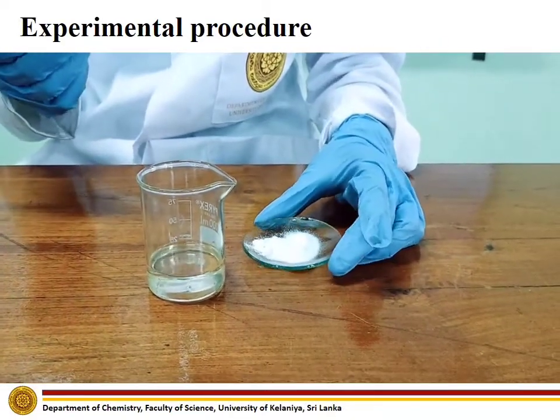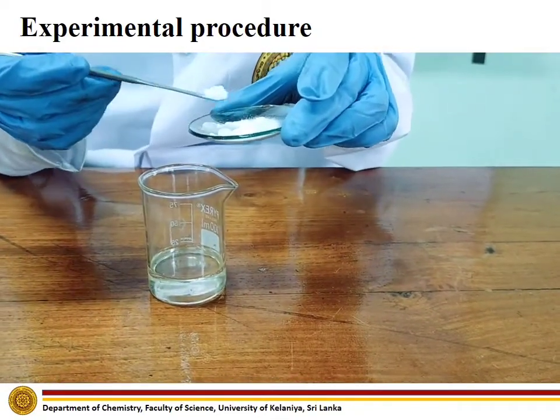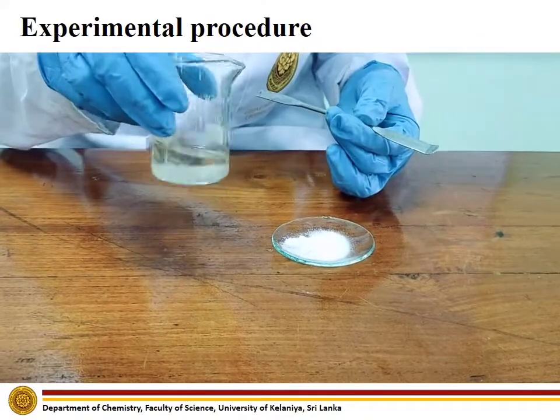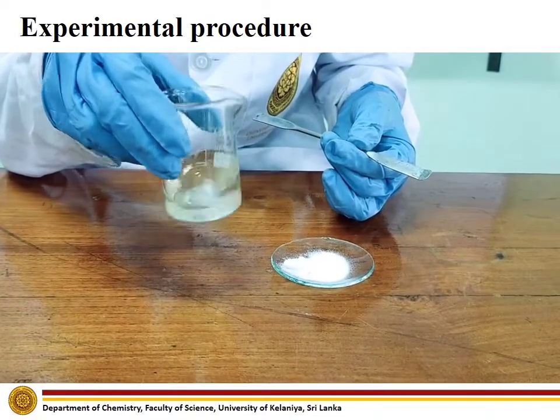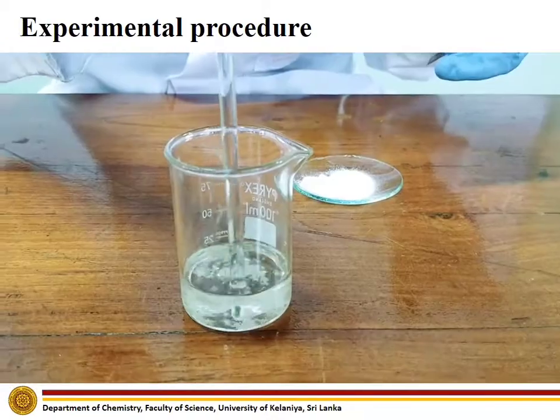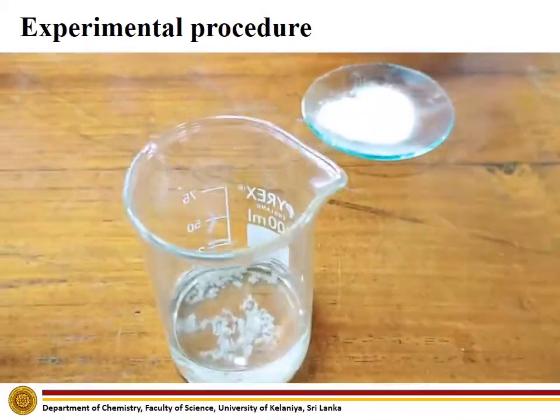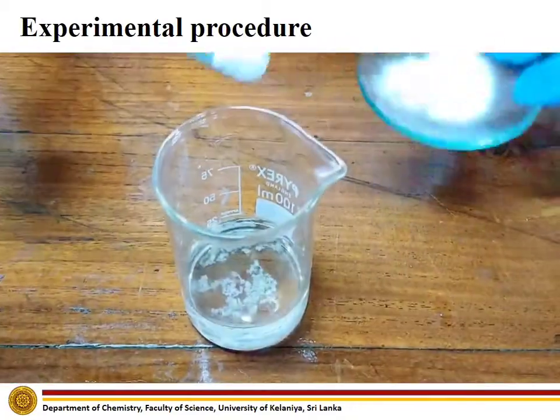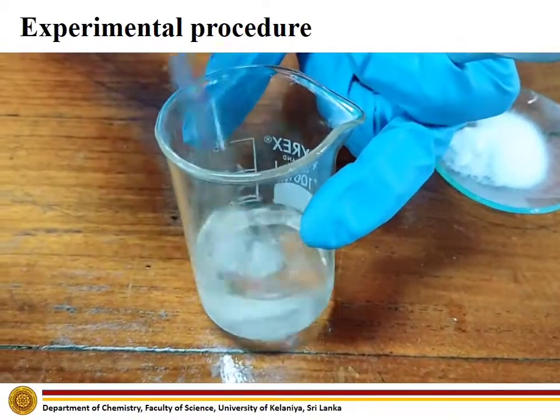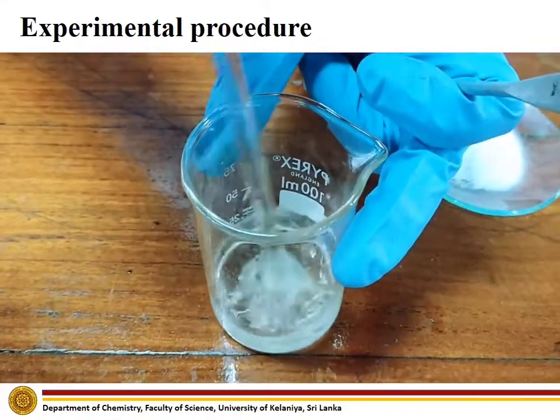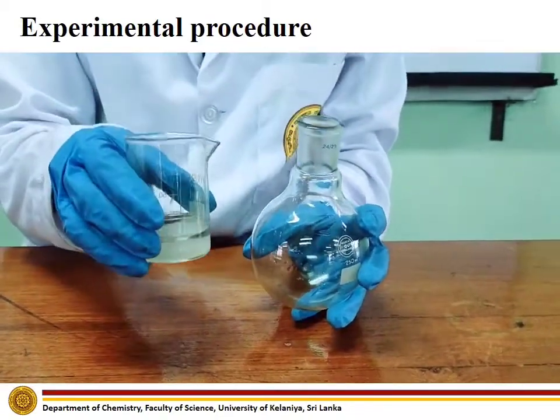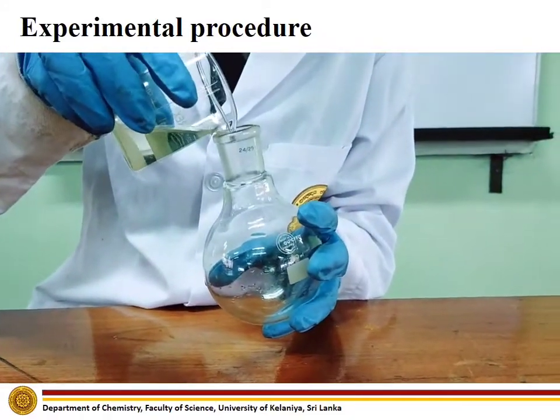Next, add anhydrous sodium sulphate into the organic fraction as the drying agent. Continue adding sodium sulphate until it no longer clumps together when swirled. Decant the liquid into the round bottom flask, leaving behind the solid sodium sulphate.